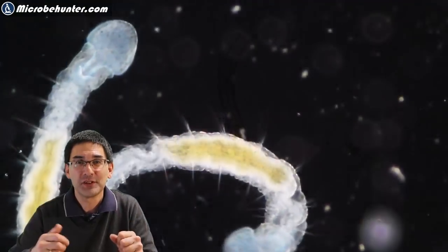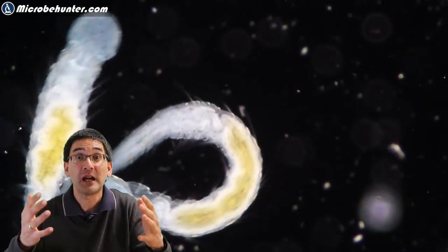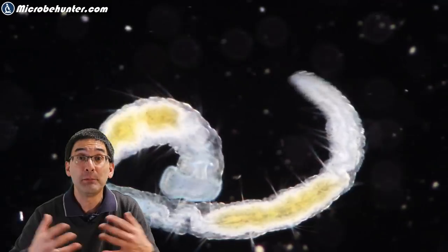And not just like irregular fibers. That's an oligochaete worm called Aelosoma also found in a pond water sample.